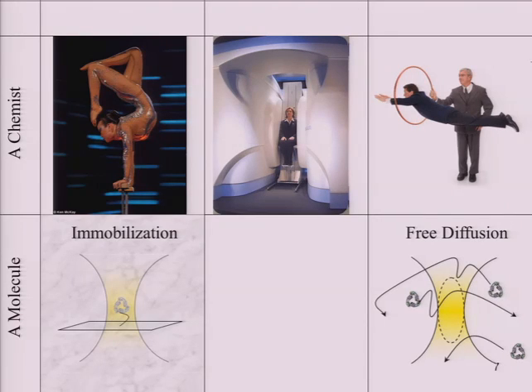In some cases, with a lot of rigorous control experiments, you can show that whatever process you're interested in is not being affected by immobilization. But that story doesn't always have a happy ending. It would be nice if we didn't have to worry about it. And so a number of groups have endeavored to fill this niche.